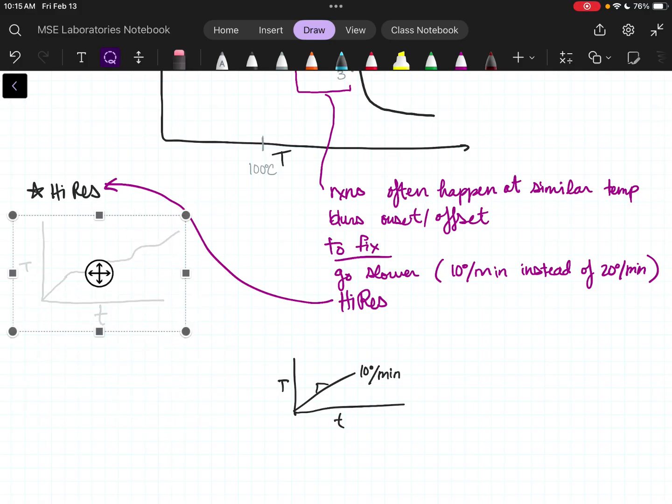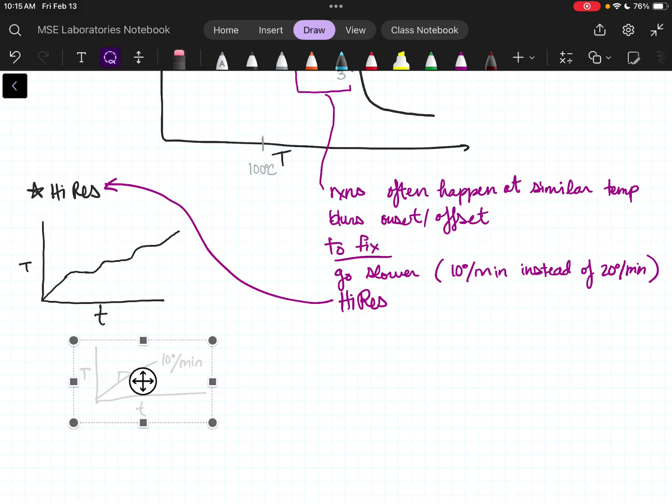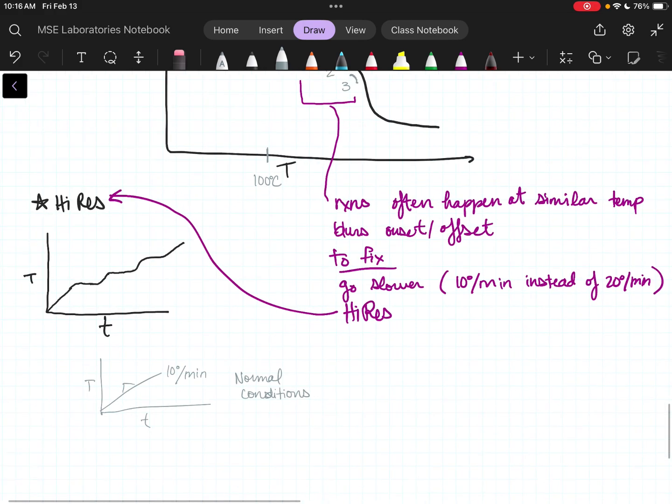So it changes the amount that it's heating, and it's like, oh, I'm starting to see a mass loss. Let's keep at this temperature until that dips down and levels out, and then it says, oh, hey, now it's been flat for a while. Let's start increasing the temperature. Oop, there's another one. Exactly. Oop, there's another one. So we get sort of what's called a quasi-isotherm. So it's heating at that 10 degrees per minute, and then it starts to see a mass loss.